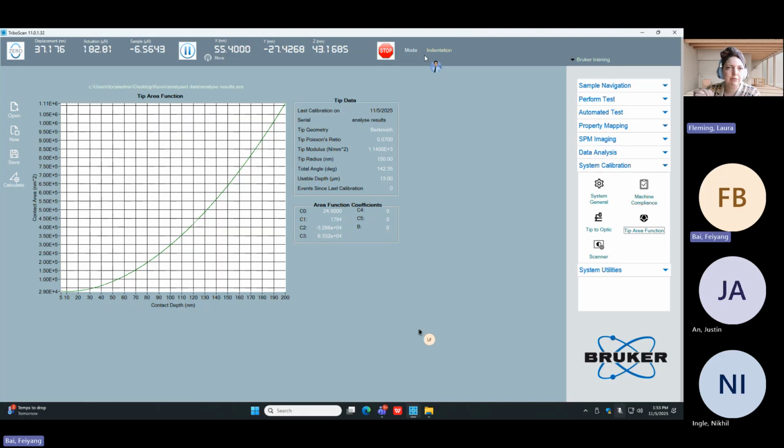Now that should set an alarm bell. You should say, Laura, you just told me that we are setting the modulus to be 69.6. So obviously the reduced modulus should be correct when I reanalyze the data. Let's say, yes, that is absolutely correct. However, we have not tied the hardness. So the hardness results will tell me the health of my system and offer any other concerns that we might need to address. Does that make sense? Okay. So in order to do so, we're going to do exactly what we did at the beginning with the group analysis, but with one important difference.